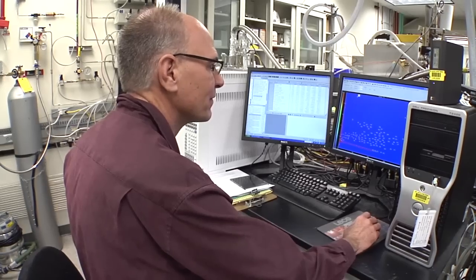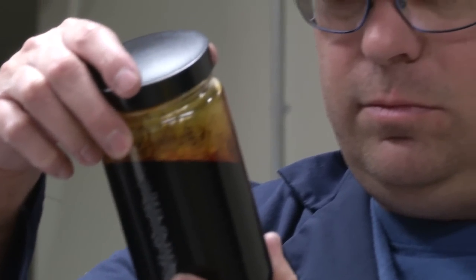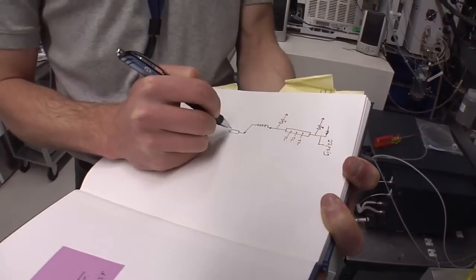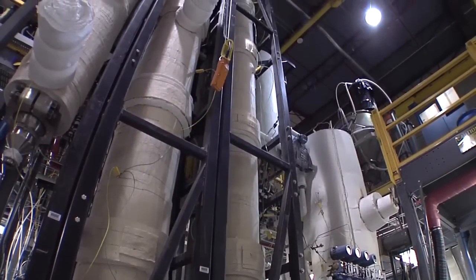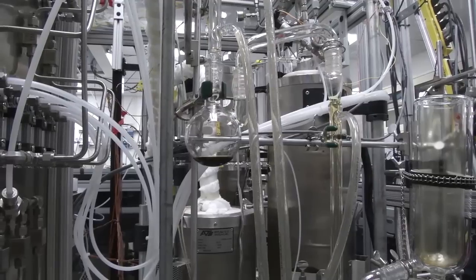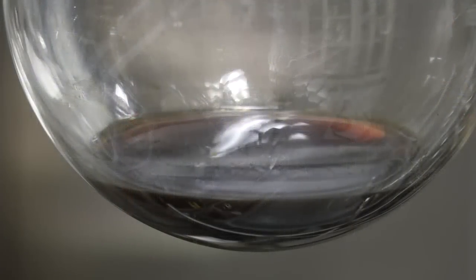A catalyst is introduced to speed up the chemical reaction that turns the biomass into syngas used in biofuel. NREL is improving catalysts for better performance and higher yields. At a laboratory scale, we've been able to develop a reforming catalyst that was recently patented and licensed by other companies that are using it to clean up biomass-derived syngas. Pyrolysis is another thermochemical approach. The biomass is heated, this time to create a bio-oil that's stabilized and converted to fuel.